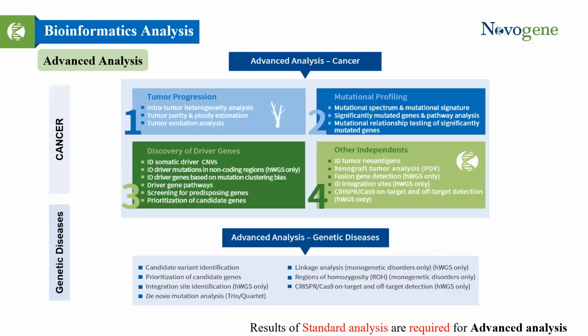After introducing the standard analysis, you may have questions like, what can I use the data in standard analysis for? Can I have a deeper insight into the analysis result? For these answers, let's introduce our advanced analysis. Please note, results of standard analysis are necessary for advanced analysis.